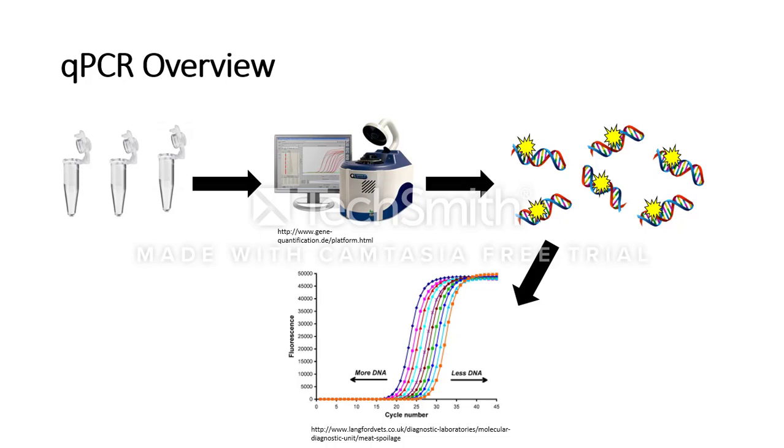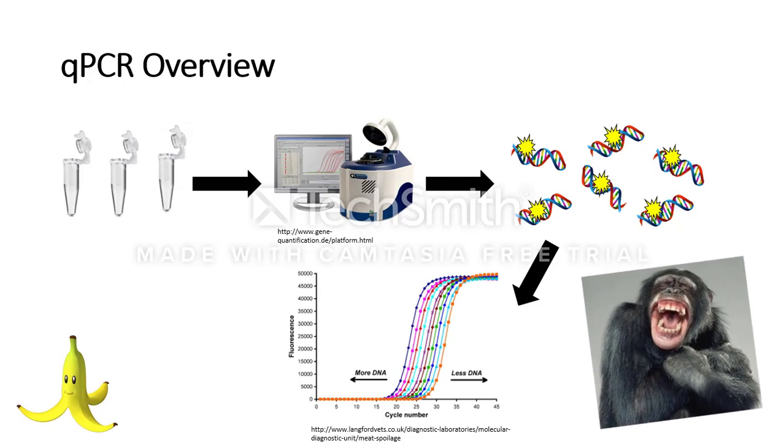Now, let's put everything together. First, when conducting qPCR, a qPCR reaction is prepared with the addition of fluorescent dyes or fluorescently labeled primers. Then, the reaction is placed in the qPCR machine. Fluorescence will then be produced during the reaction and measured by the machine in real time. The amount of product can then instantly be compared to a known standard, which is the number of copies produced at each cycle in the process. And that's qPCR in a nutshell. Or should I say, banana peel.